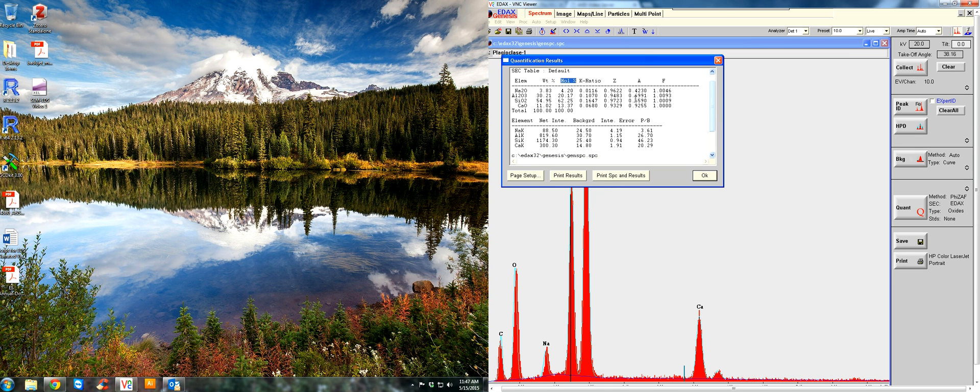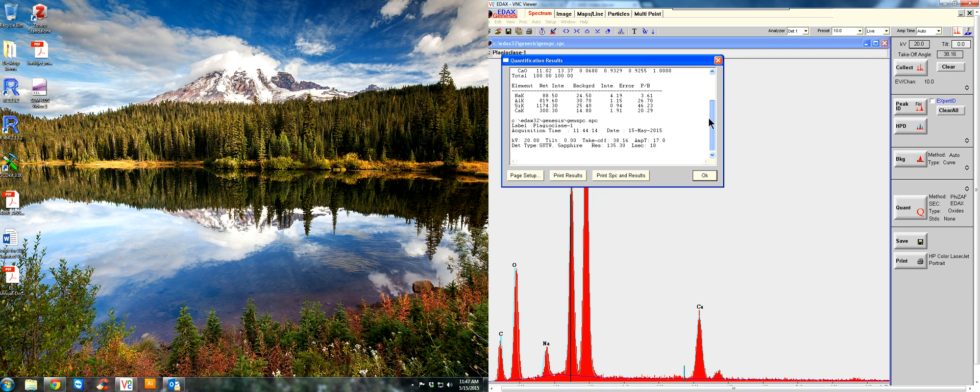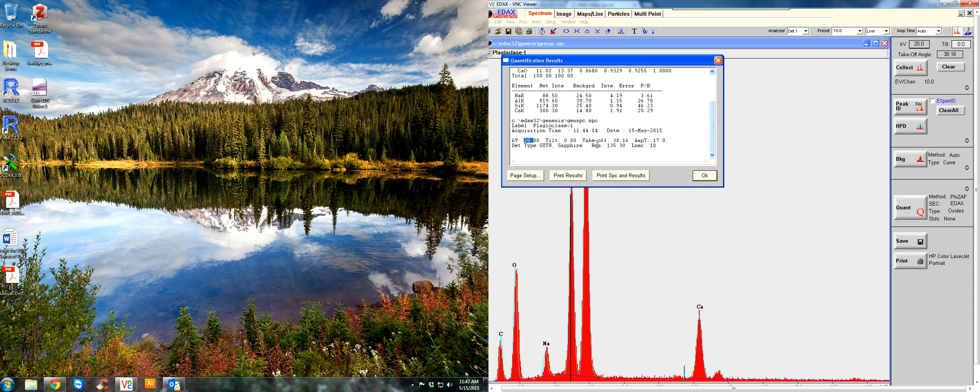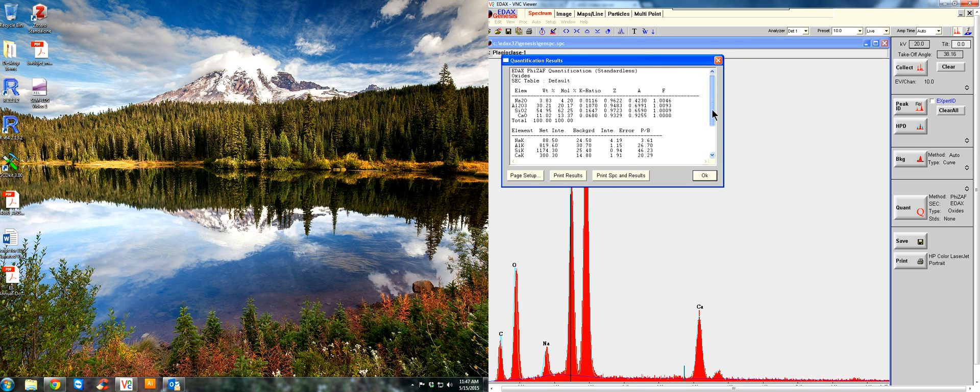And then right here at the bottom, this is your net intensity: the raw data, your background, and all this raw data. You can save this as an Excel file. Here, it'll give you information about the system: KV, the tilt, takeoff angle, amp time, the window you use, the count time, the preset live seconds, 10 live seconds to analyze this. You can save this along with the image file if you want to. So you can press OK. It's been quantified.